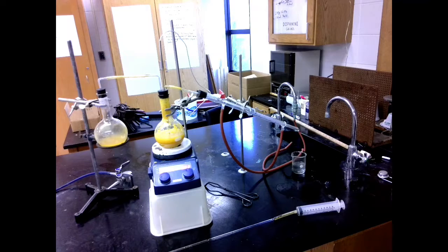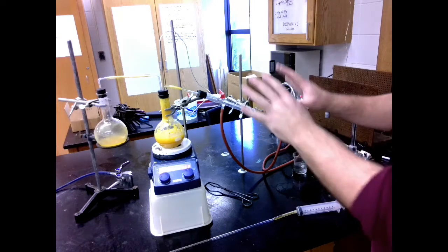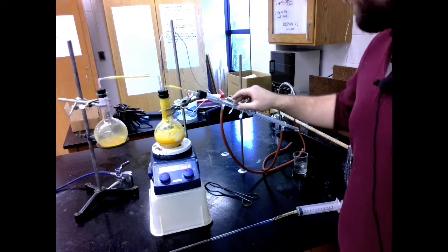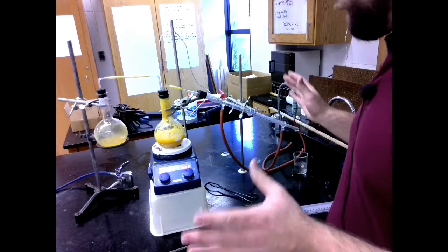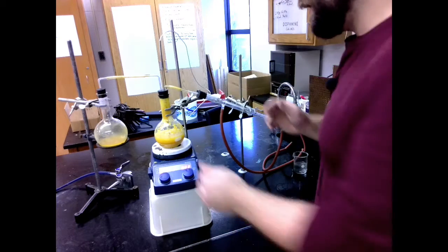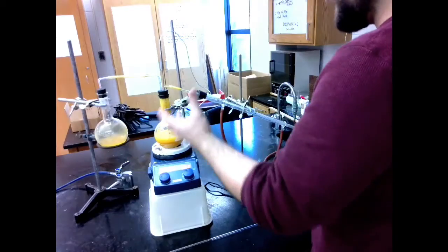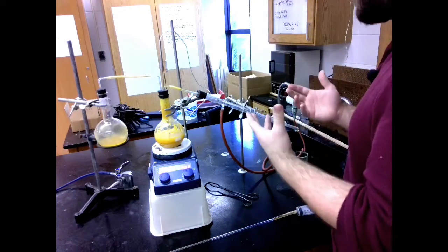Finally, once your oil has been collected, you should be able to go ahead and dismantle all of it. Give all of this time to cool before you take it apart. We don't need to burn our hands. We're not in a rush. But we've got this. This section will be nice and hot. This will be hot. This is just producing steam. This is all very hot. So give it a minute to cool down.